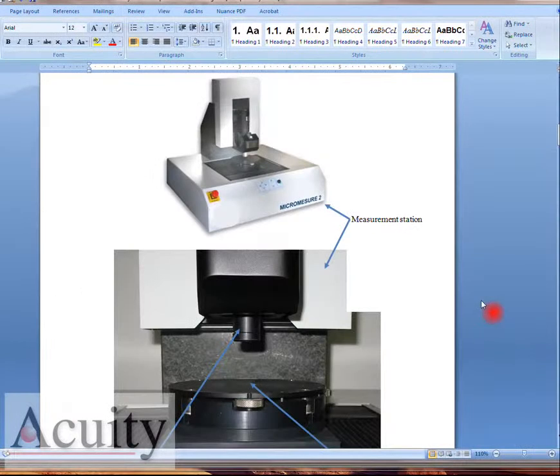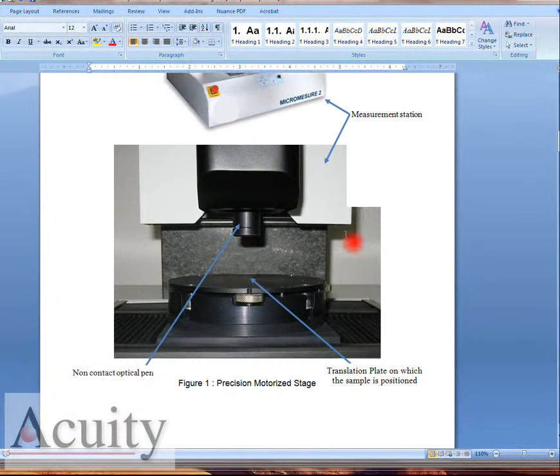Let me show you real quickly. Here's the stage we used. In this case we've got a little XY stage that you can see here. It's motorized. We have glass scale encoders of 0.1 micron, Galil glass scale encoders in the X and Y.